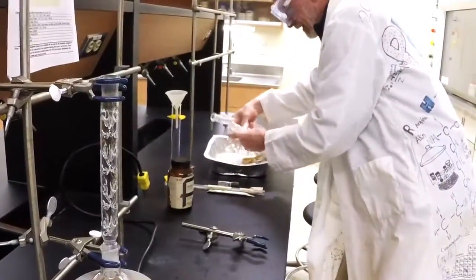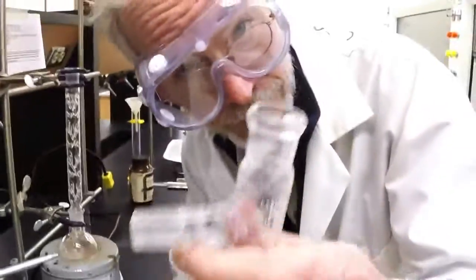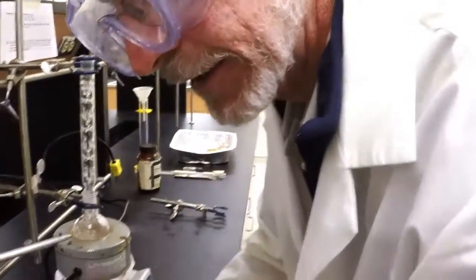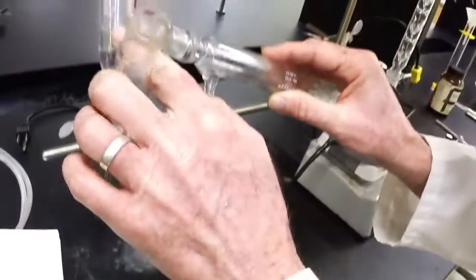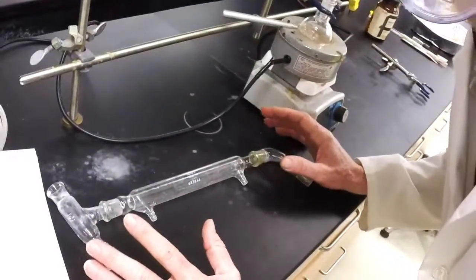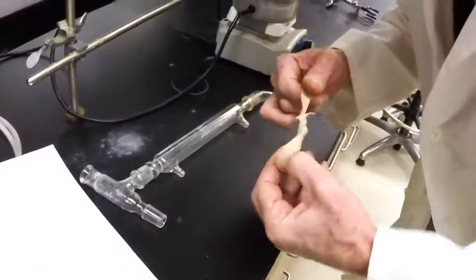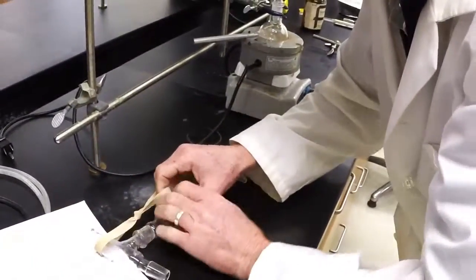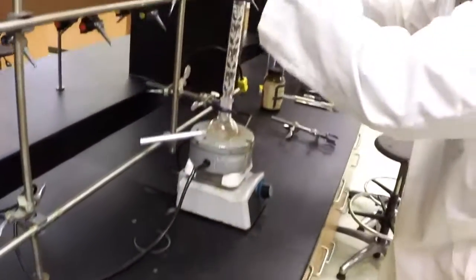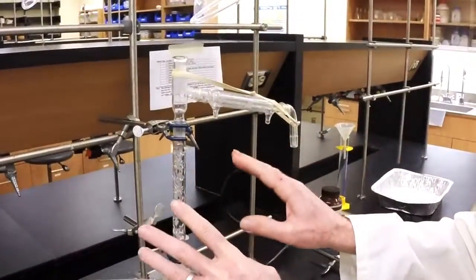The distillation itself requires these three pieces: you have the still head, the take-off, and the condenser. These pieces go together — still head, condenser, take-off. And to hold them together, we are going to use a rubber band. Be careful now, you could shoot this across the room. Stretch the rubber band carefully, snap it on there, and gravity will hold it in place.